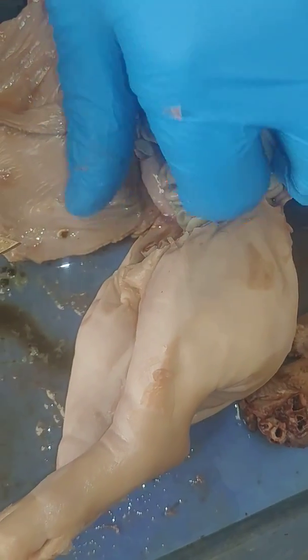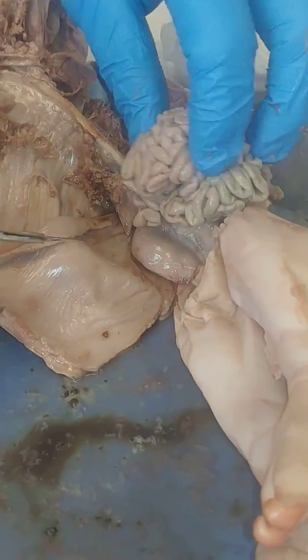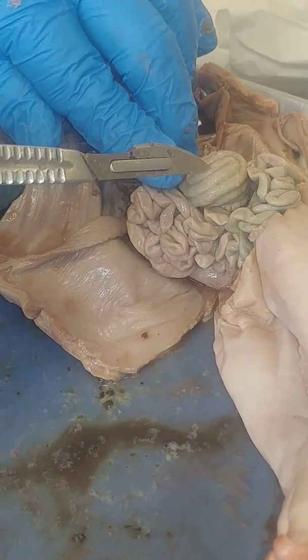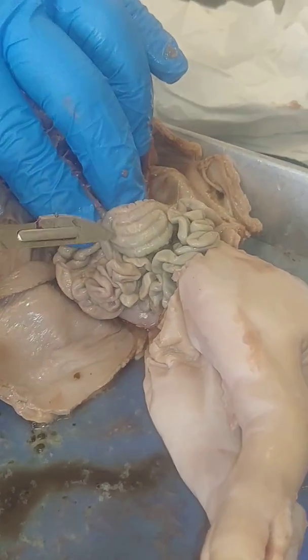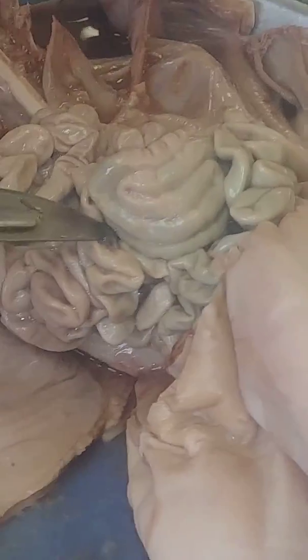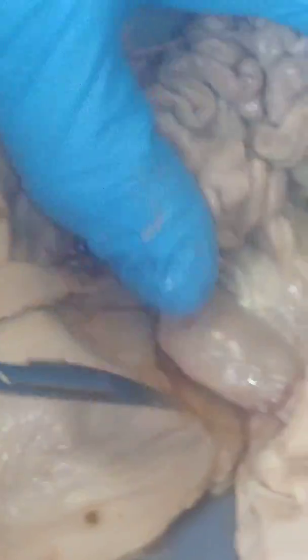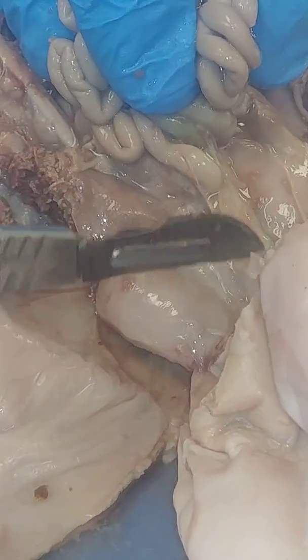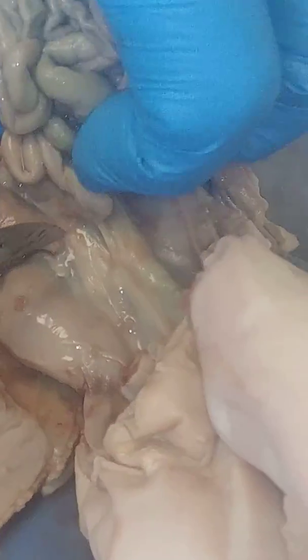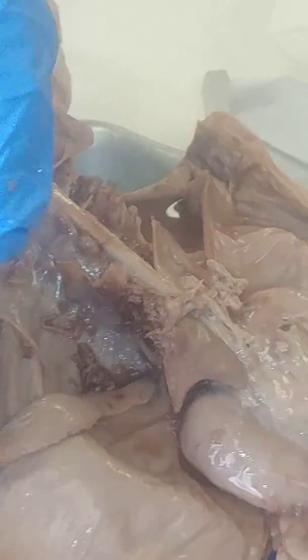Okay, so then we've got the intestines. Now, on us, there are about 21 feet of this material right in here. Now you see where it changes here, and it's a little bit more solid looking. This would be the large intestine. A little bit different coloration. In humans, that's going to be about 8 foot long. So you've got close to 30 feet of intestines. And then you got the last part here. This is called the rectum. Coming in down here where the waste material is going to leave the body. So we're going to remove this.